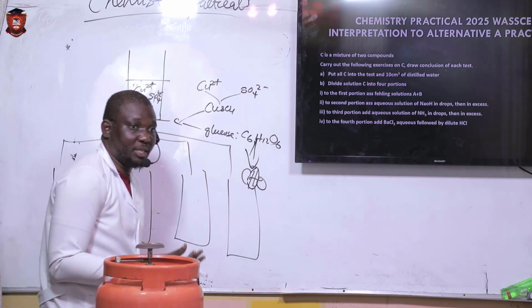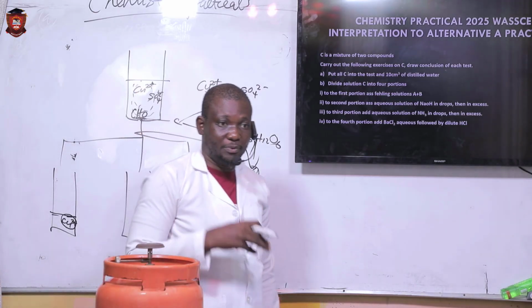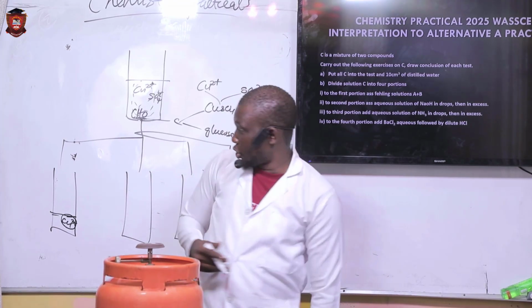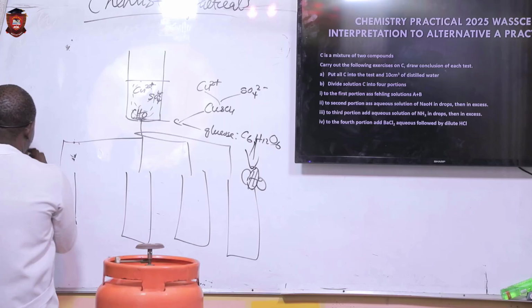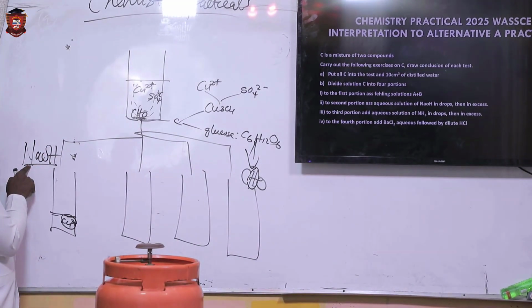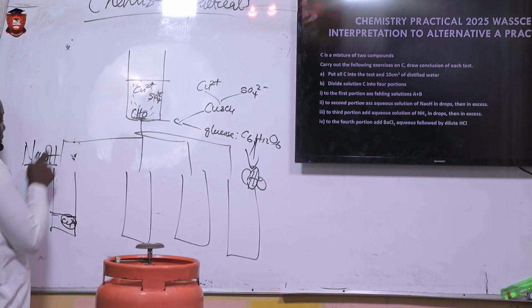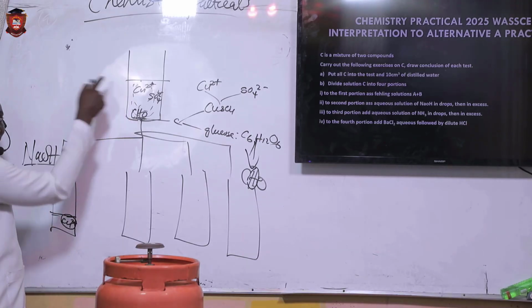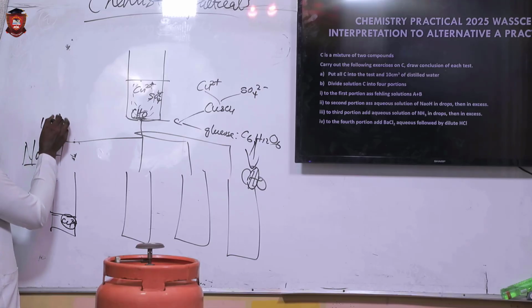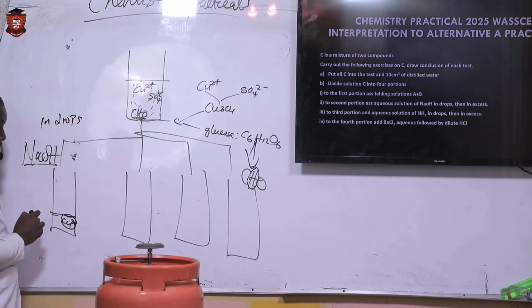So if you want to precipitate an insoluble hydroxide from a salt, you use sodium hydroxide. So sodium hydroxide is going to do the job. So sometimes when you see this reagent, please, as far as this test is concerned, know that it's used to identify this cation. You will use it 2 times. You use it in what? Use it in drops and know what happened.